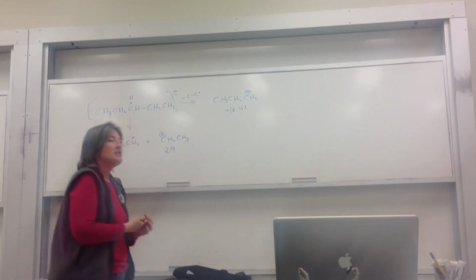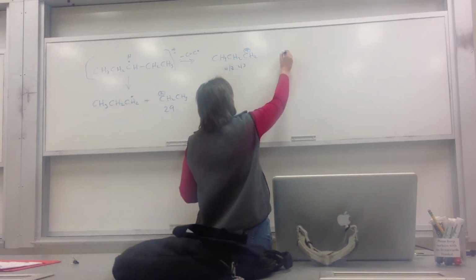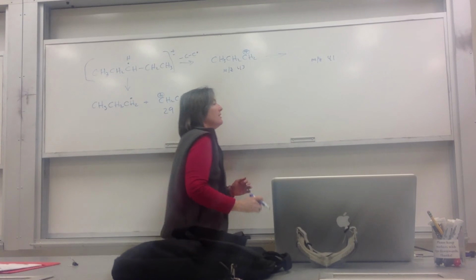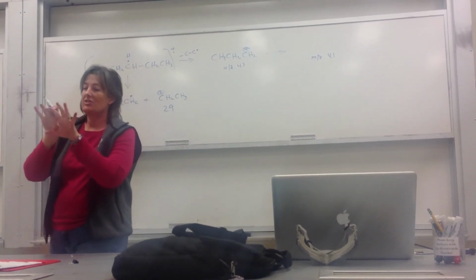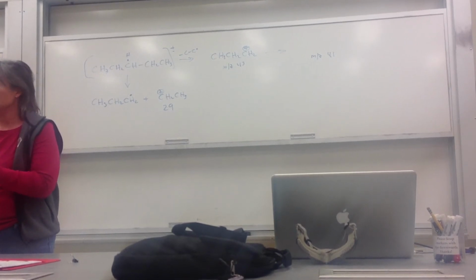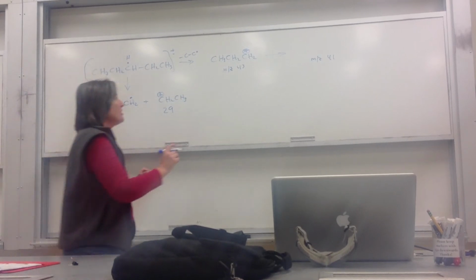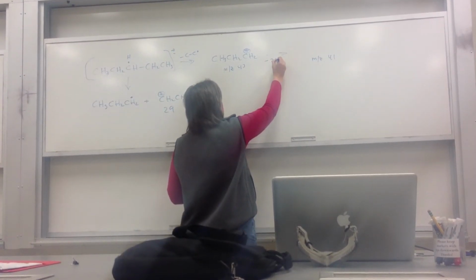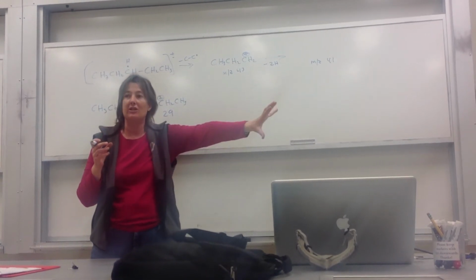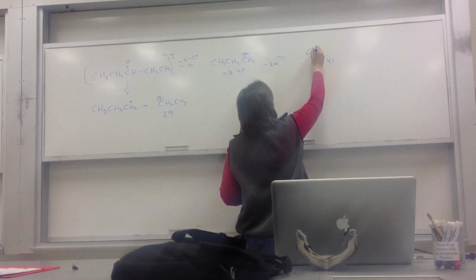You almost always see with a propyl or an isopropyl group, you see something coming over at 41. And what those typically are, the things that are clustered around a peak, are where you have gained or lost hydrogens. And a 43 almost always comes with a 41. What's gone on there is you have lost 2 hydrogens. And that is as that fragment is flying through the instrument, it's doing things. And what in this case it's doing is this.